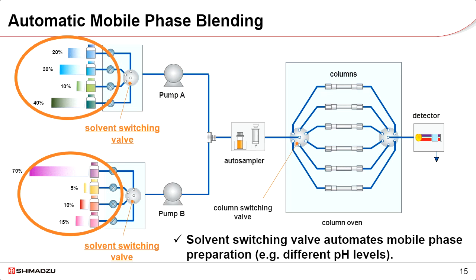And while solvent switching valves as part of a method development system are not necessarily revolutionary, one thing that Shimadzu's Nexera series provides is the ability to do what is called solvent blending. We then use a low-pressure gradient valve in each of our installed pumps. If we're working with an LC or UHPLC system, then in both the aqueous and organic pump, we can have automatic proportioning valves that will allow us to create blends at a percentage level automatically.